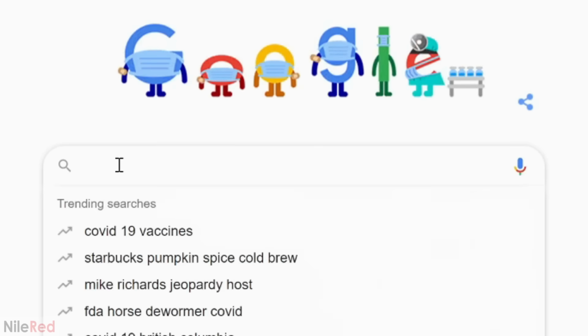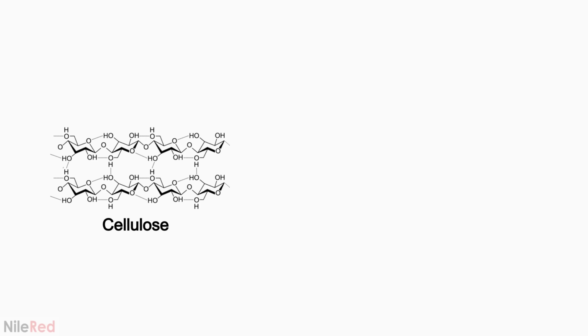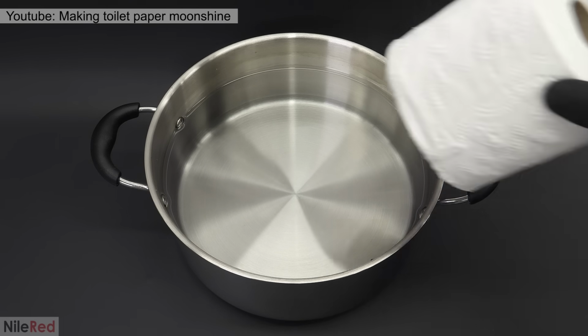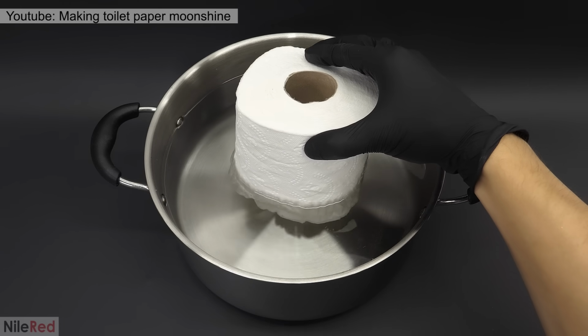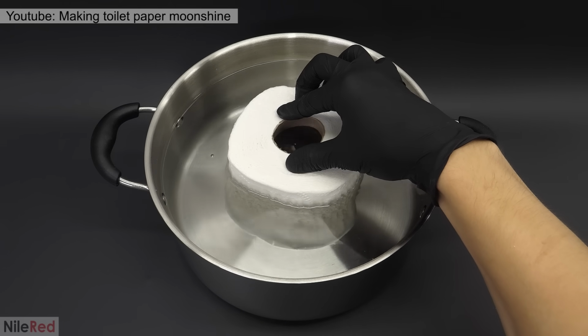To get started, the first thing that I had to do was figure out how to even do it. I had to come up with a way to break down the cellulose back into sugar, and my first idea was to use an enzyme. This was because I had already used an enzyme for another project where I turned toilet paper into drinkable alcohol, and it had worked really well.